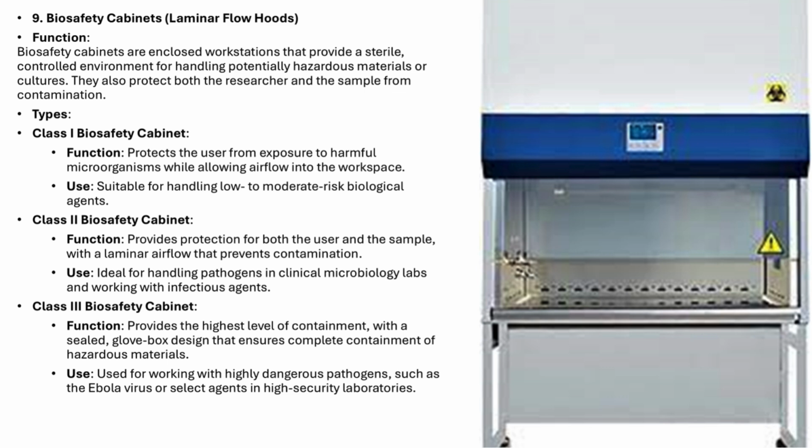Class 3 Biosafety Cabinet. For the highest level of containment, there's the Class 3 Biosafety Cabinet. This type has a sealed, glove box design that ensures complete containment of hazardous materials. It's used in labs working with highly dangerous pathogens like the Ebola virus or select agents, offering the most stringent protection for both the researcher and the sample.